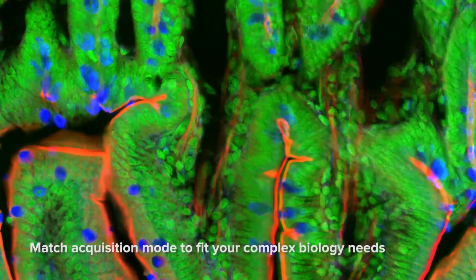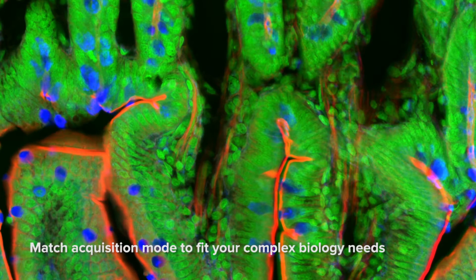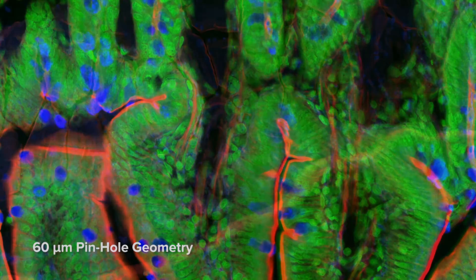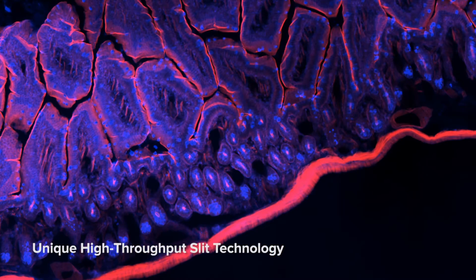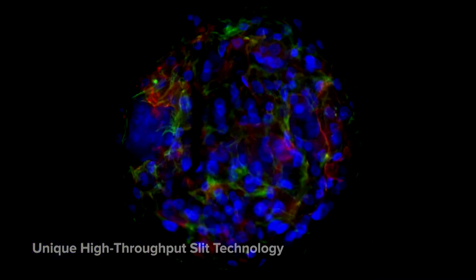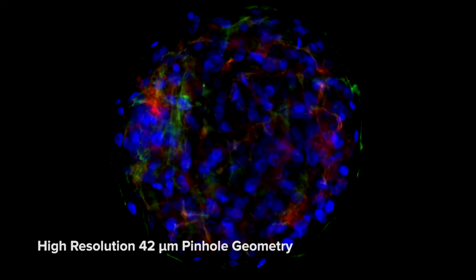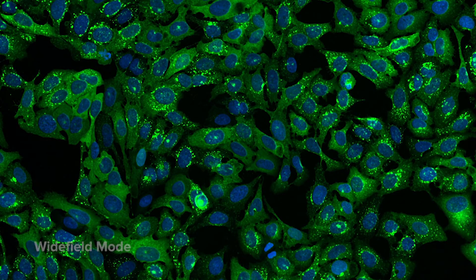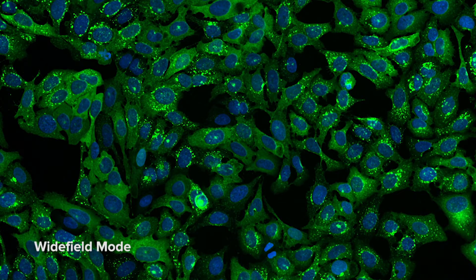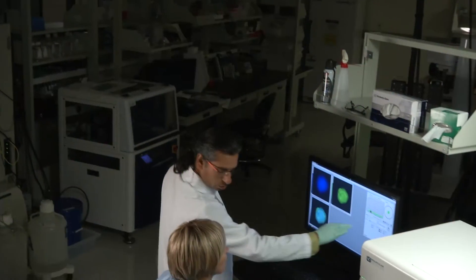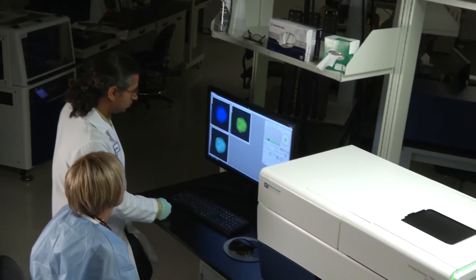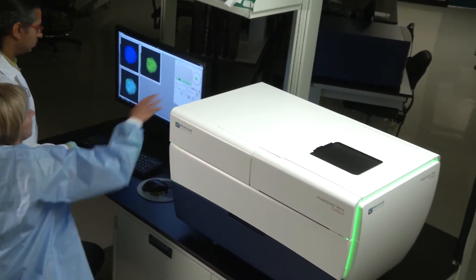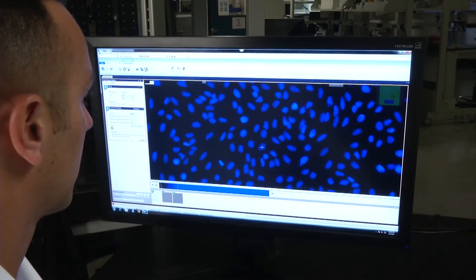Confocal imaging enables rejection of high background signal to yield superior image quality in tissue samples or 3D assays and high throughput confocal imaging, or research confocal imaging when distinguishing fine objects is critical, and wide field imaging for the fastest throughput and sensitive imaging ideal for 2D biology.